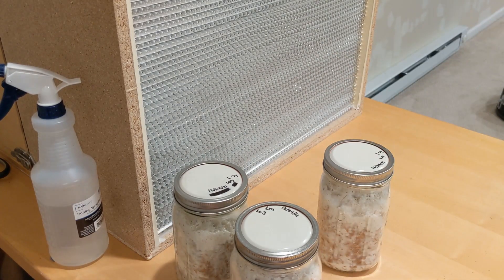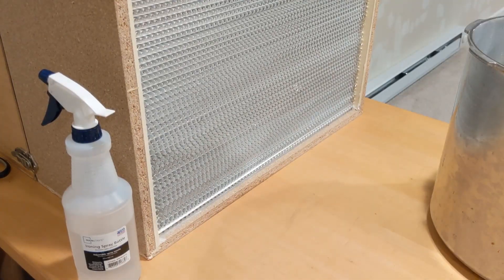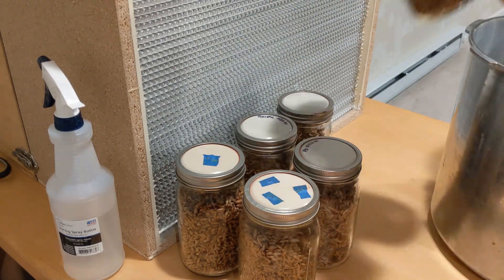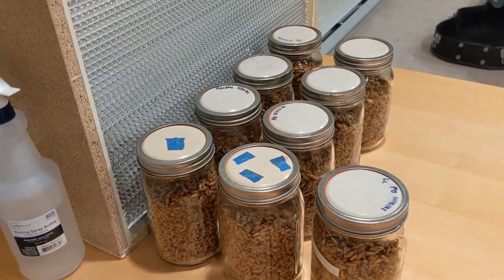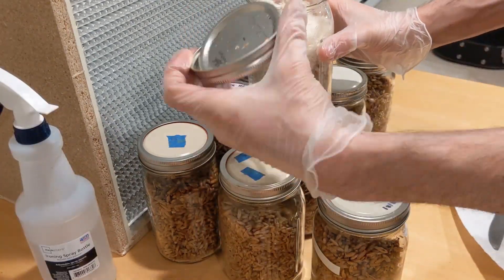I went ahead and put the cultures I was not going to use away and proceeded to unload my pressure cooker. This is pretty much what I do every time I inoculate — I have my flow hood running about 30 minutes prior to make sure the air and everything in front is nice and clean.